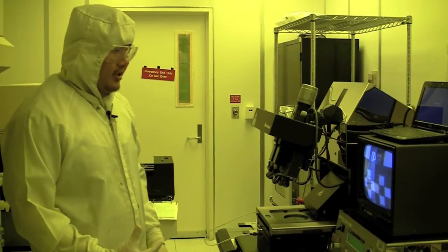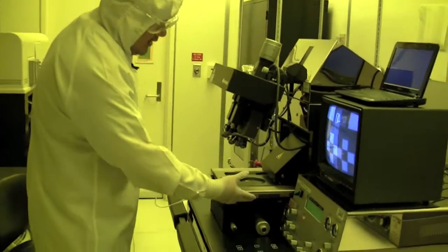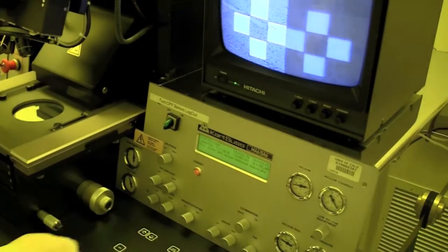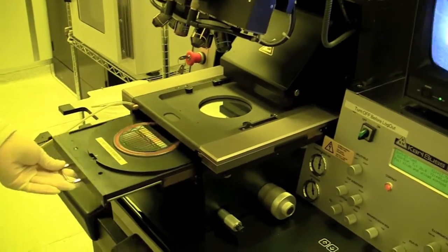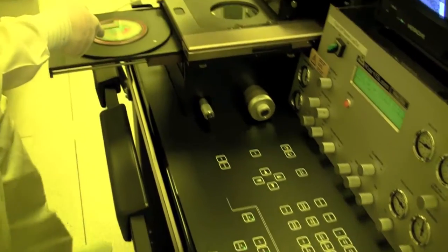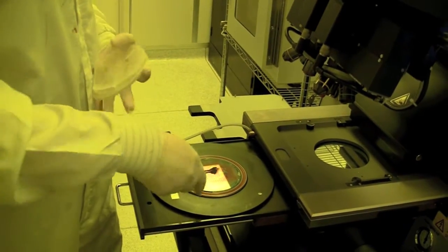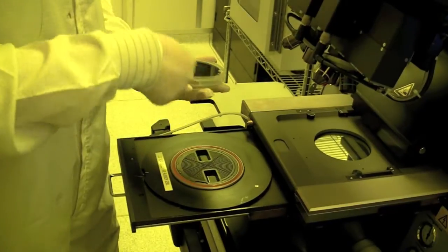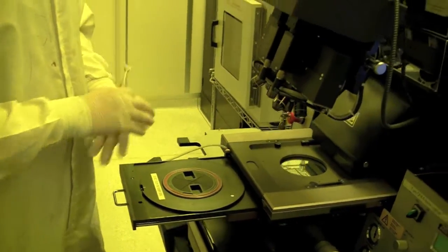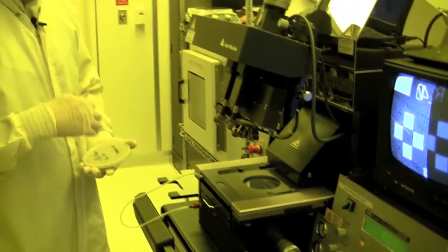After exposure, you need to unload your wafer. You come to the screen and it says 'pull, slide, unload exposed substrate.' You just pull it out, press the enter button, and the vacuum will be released. Then you can take your wafer out. That's how you unload your wafer after exposure.